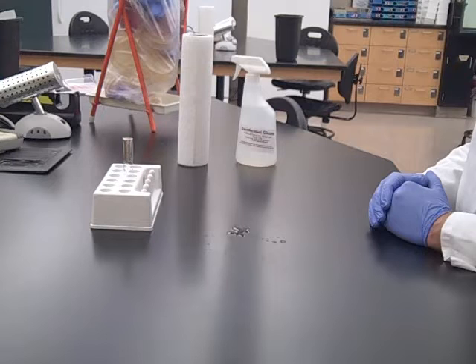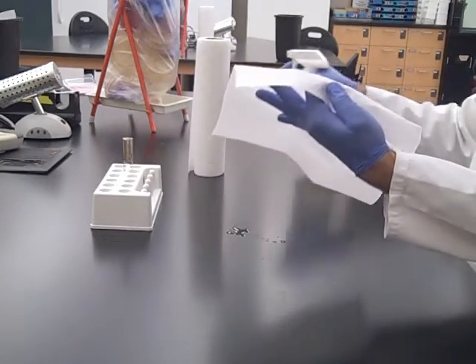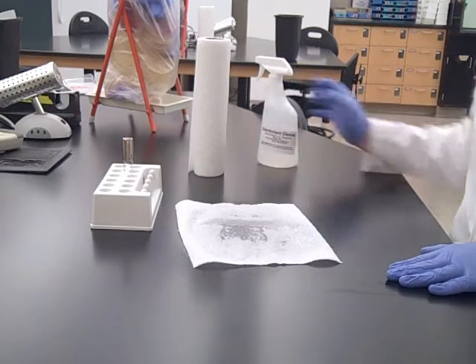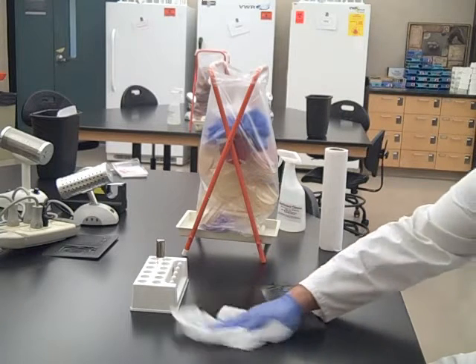If you spill a culture in the microbiology lab, the first thing you need to do is notify your instructor. To take care of the spill, spray some disinfectant on a paper towel and place it on the spill. You have to leave the paper towel with the disinfectant in place for at least 15 minutes. After 15 minutes, this paper towel is disposed of in the autoclave trash.